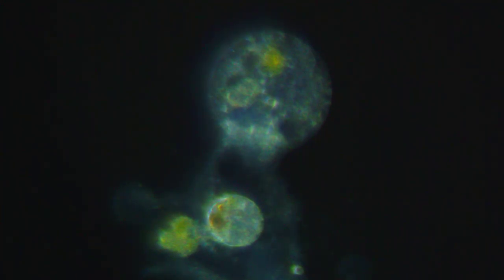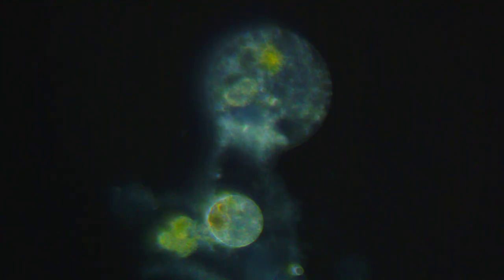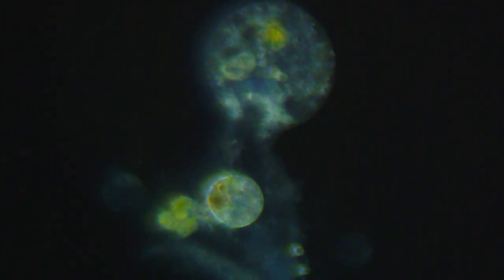It looks very similar to what I thought was a rotifer earlier, which I'm now thinking it's not. It's got those little cilia, but it's more orb-ish. And it looks like it's trying to eat something, or it's stuck to something here. Or who knows?